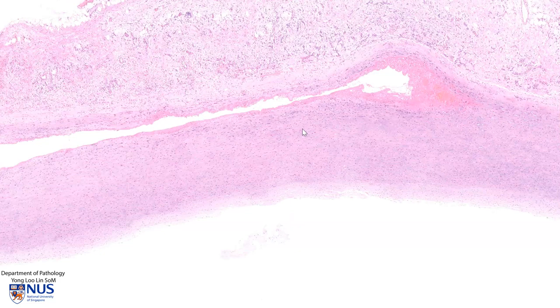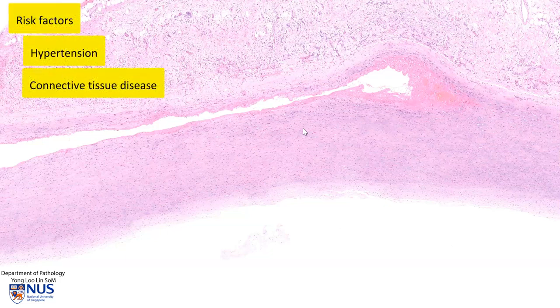In real life, this would have been filled with blood, but this has dropped out during processing. This aortic dissection usually occurs as a result of weakening or damage of the aortic wall, and some very important predisposing factors would be hypertension or pre-existing connective tissue disease.